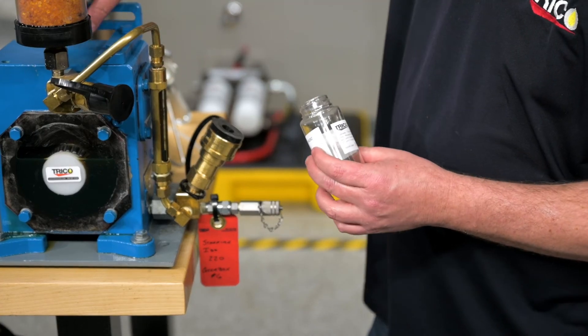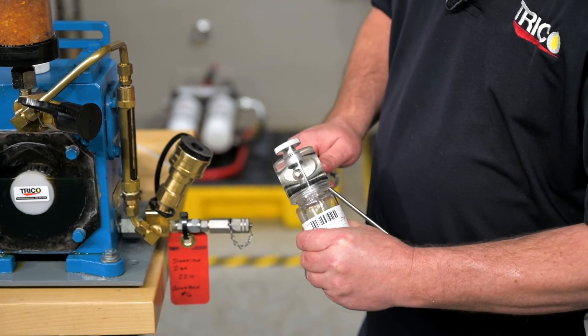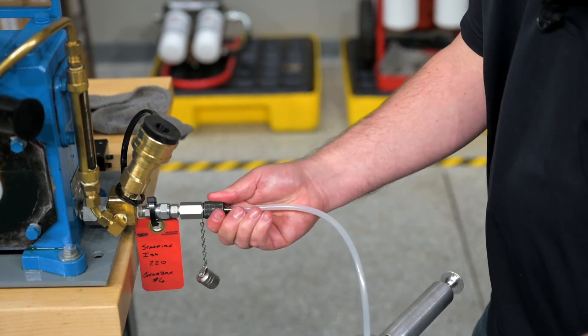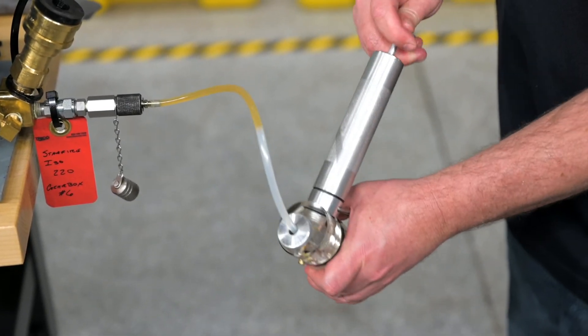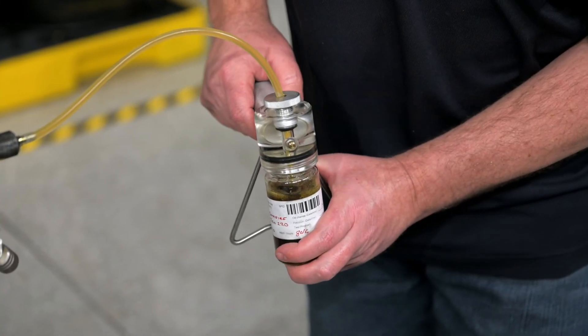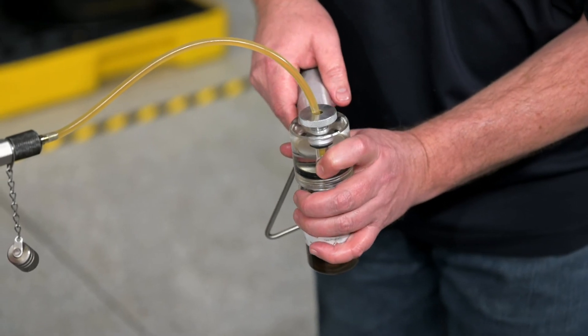Then we'll open up our sample bottle and screw it onto the vacuum pump. Remove the sample port's cap and screw the sample port adapter into the sample port. We can then begin pumping to create a vacuum in the bottle to draw the oil into our sample bottle. Keep pumping until the oil fills up to about two-thirds of the bottle, then press the pressure relief valve to release the vacuum.